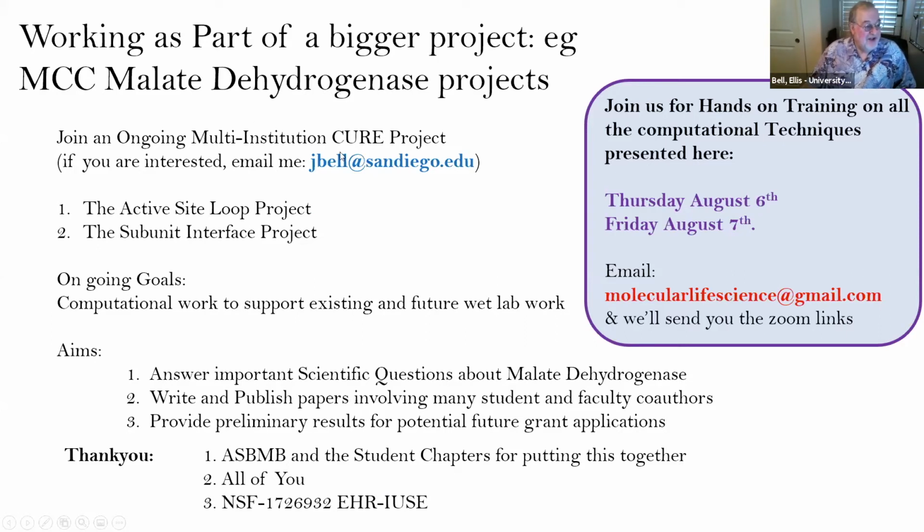But if you want to join, if you want an off-the-shelf project on malate dehydrogenase, let me know. Email me. We've got 2 ongoing projects that are multi-institution projects. One involves the active site region, one involves the subunit interfaces. There are other projects always coming online. So let me know if you'd like to join those.